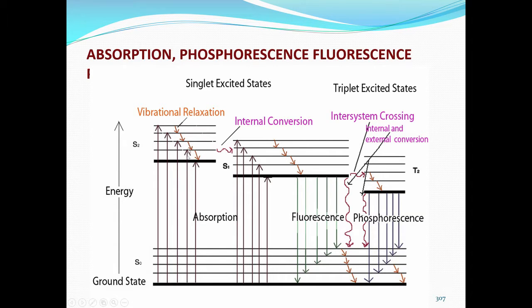So, in the absorption phenomena you can see that the energy is simply absorbed and the output is having an energy less than the incident energy.